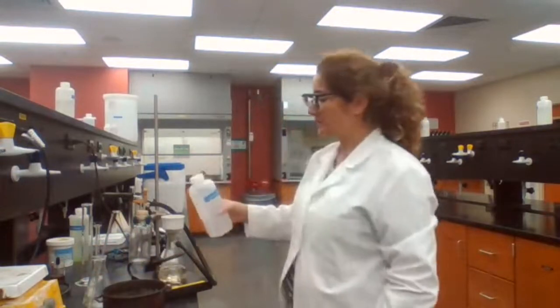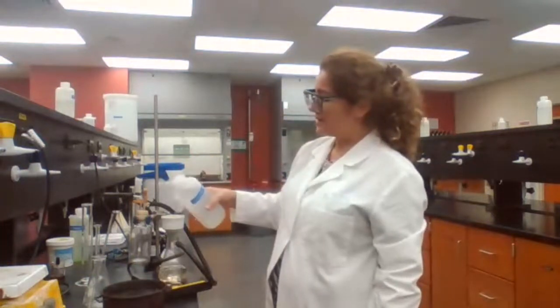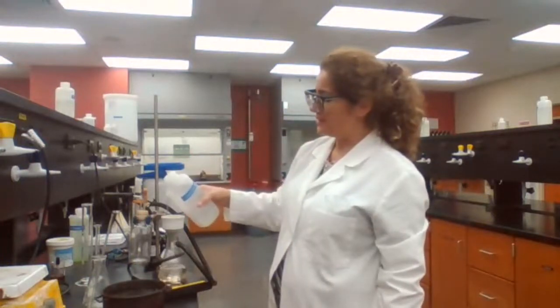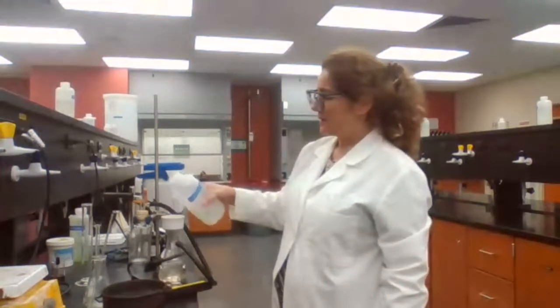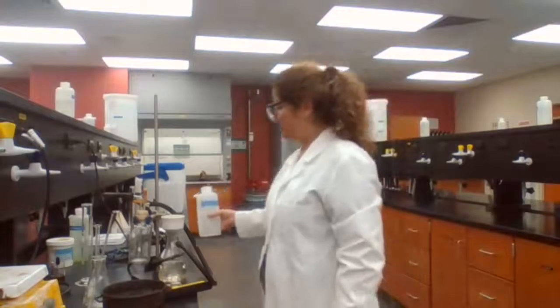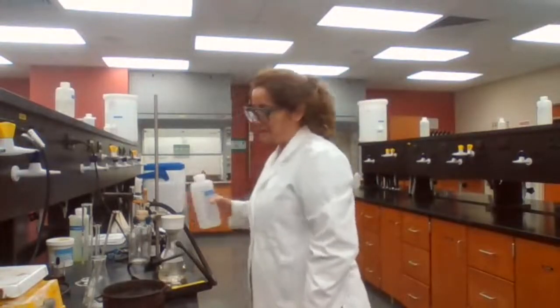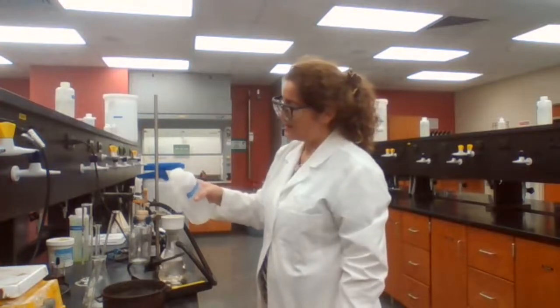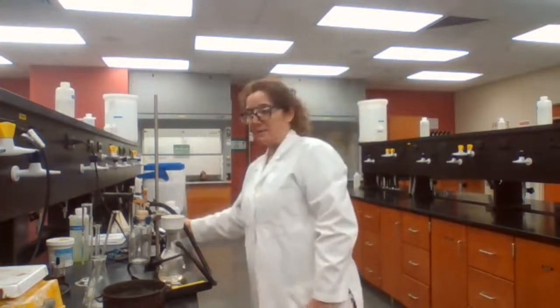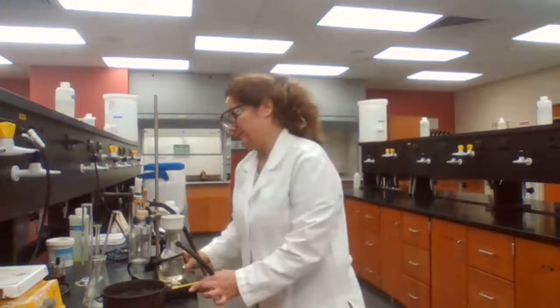If it's hot, all of it is going to melt. But if it's cold, a minimum amount of the sample is going to melt. So I use cold water to wash the crystals and time it now. We wait for 5 minutes.